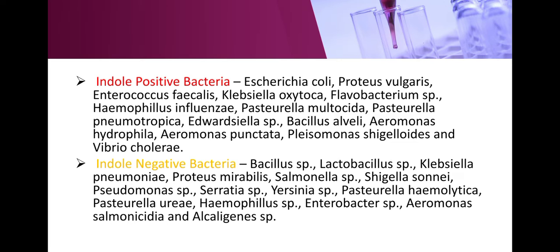Indole negative bacteria: Bacillus species, Lactobacillus species, Klebsiella pneumoniae, Proteus mirabilis, Salmonella species, Shigella sonnei, Pseudomonas species, Serratia species, Yersinia species, Pasteurella haemolytica, Pasteurella ureae, Haemophilus species, Enterobacter species, Aeromonas salmonicida, and Alcaligenes species. These are coming under the indole negative bacteria.